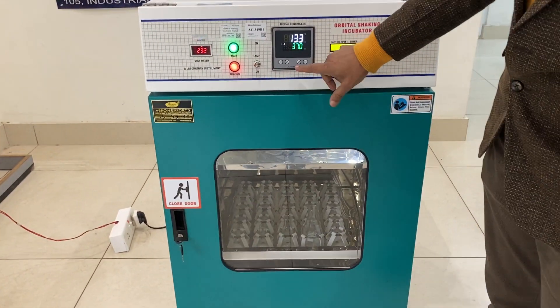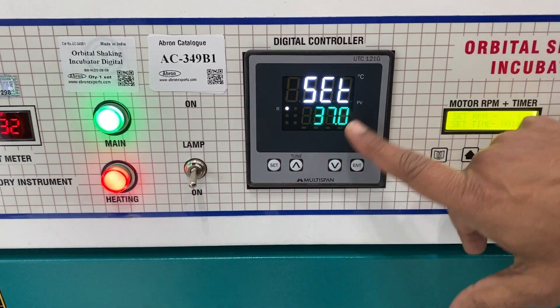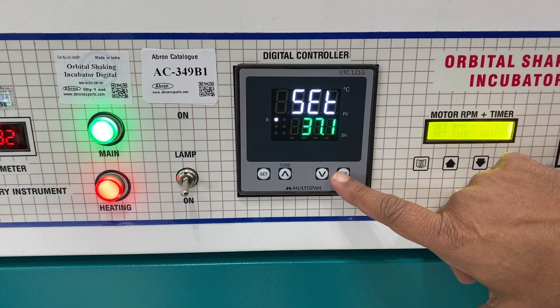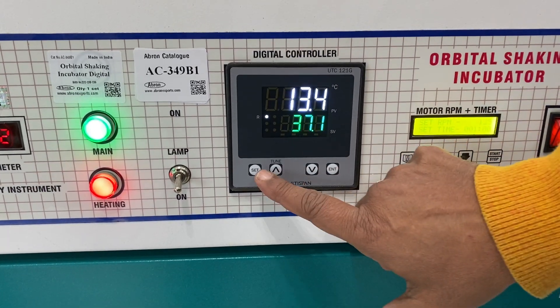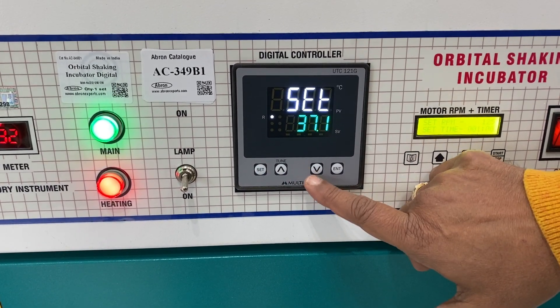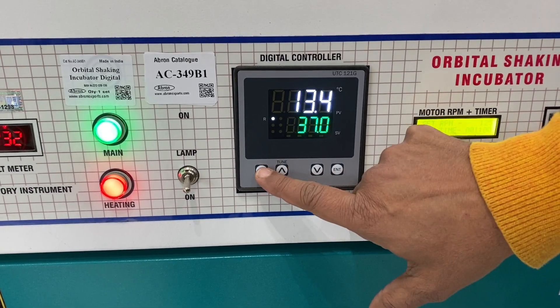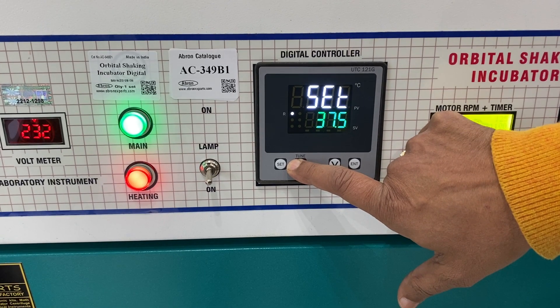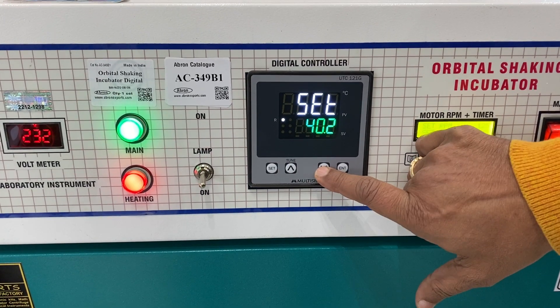Let us understand the panel working. For setting the temperature, you press it and it tells you the current temperature. You can increase it — for example to 37.1 — and then press Enter. Now it will control to 37.1. Let me bring it back to 37 and press Enter again. I can set it to any temperature.